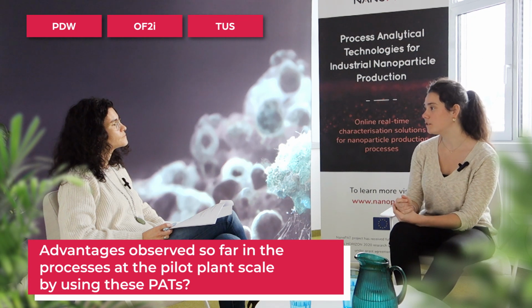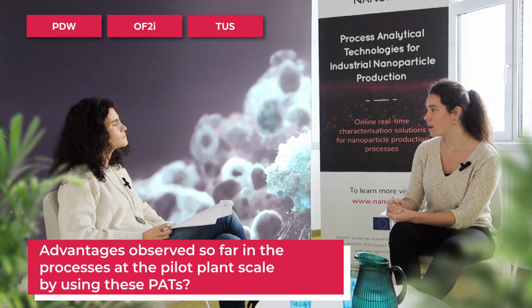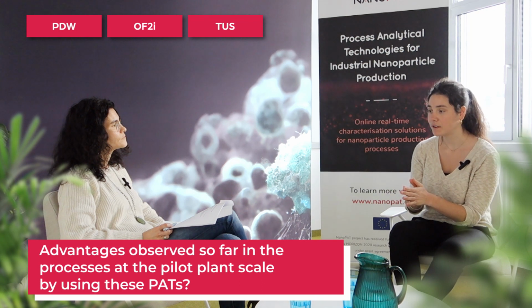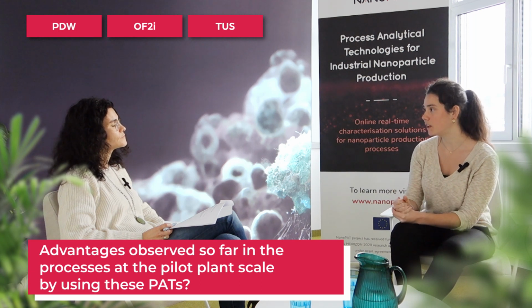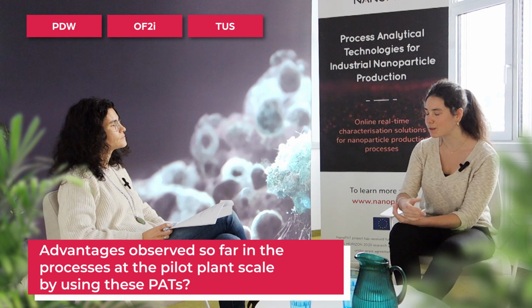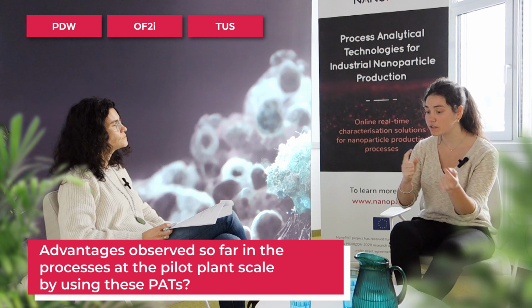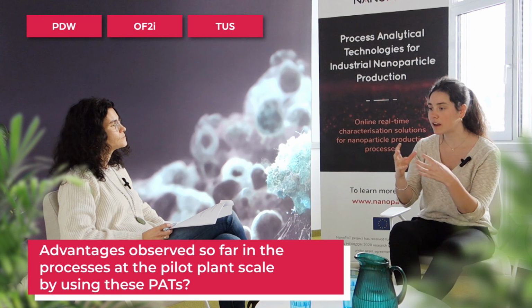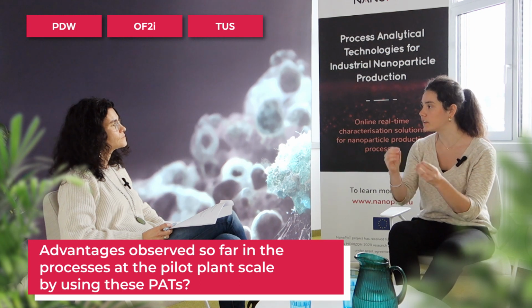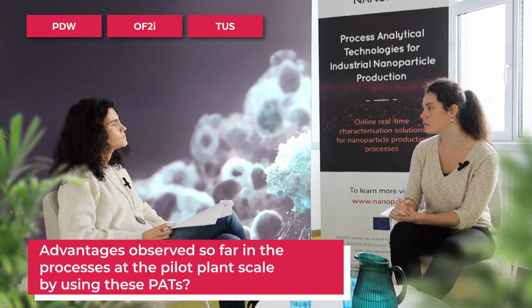For example, the PDW is an inline monitoring technique, so we have a probe that is directly immersed in the reactor, and we are able to measure the particle size of the latex directly in its system without modifying anything. So that's a really good thing, even when we are working with high solid content and high particle sizes, because it observes how it emits a light, and it looks at how this light is decreasing in intensity, and the phase is changing after colliding with a lot of particles. So this is a really good thing.